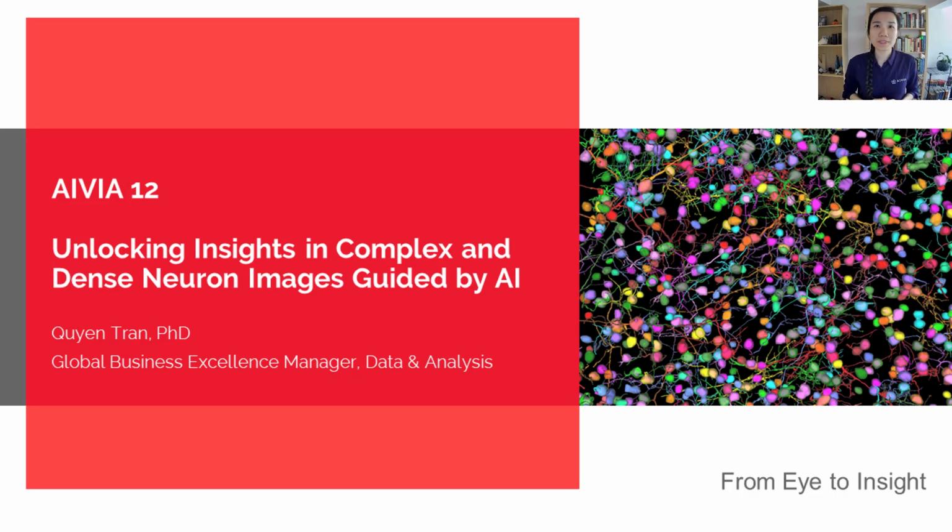I am the Global Business Excellence Manager for the Data and Analysis team at Leica Microsystems. Today, I'll be introducing you to our latest release, Aivia 12, in which we introduce tools that help you unlock insights in complex and dense neuron images.